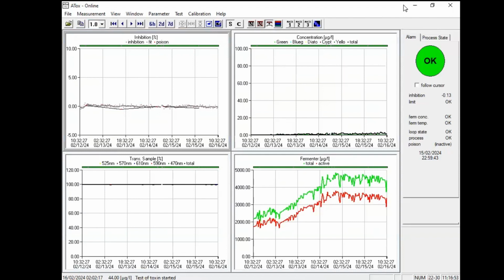And then the system is pumping in water and emptying it again. So it's rinsing the sensor 2 times with water, and 3 times it's pressing it free with air. How is it pressing? There is an air compressor pushing the air inside.